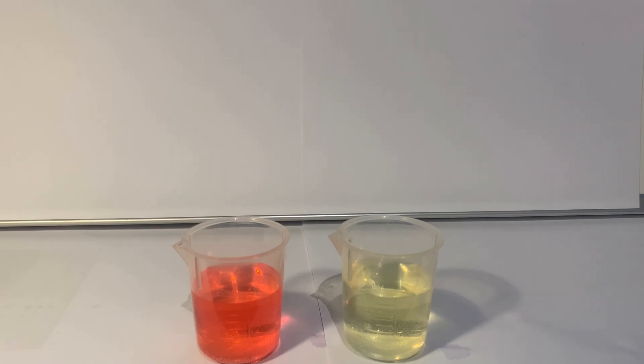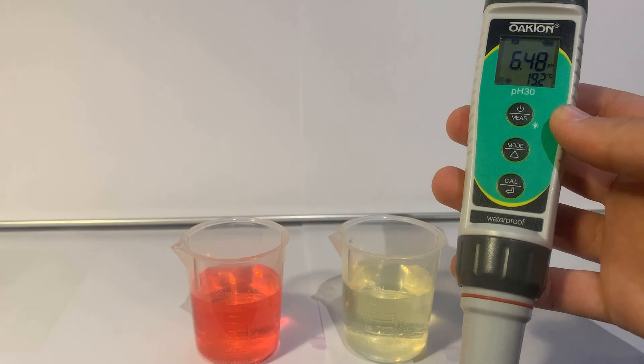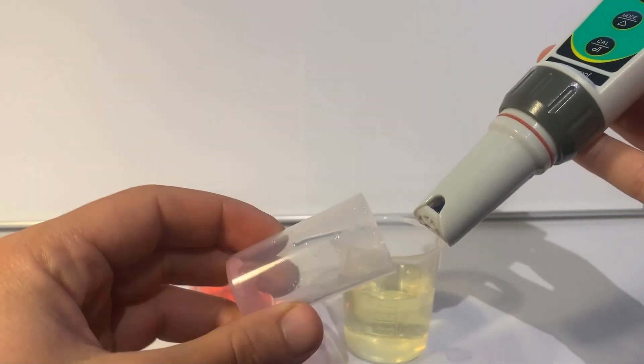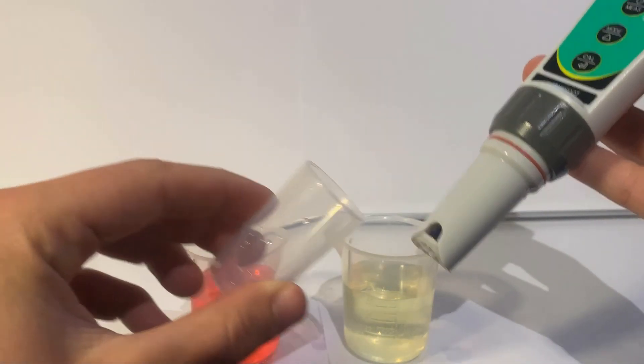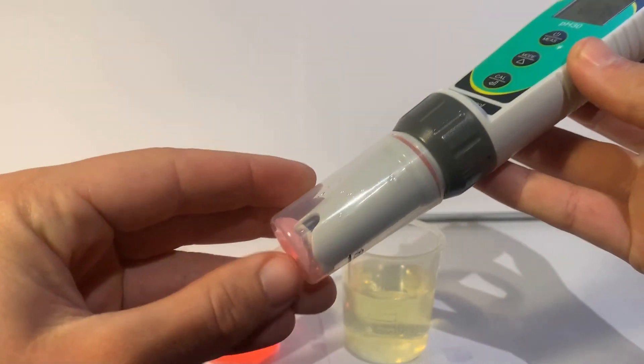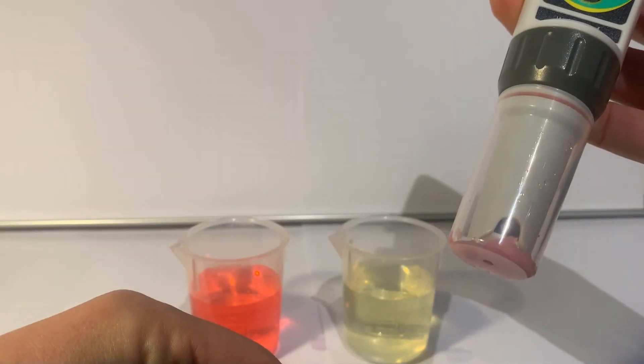Store your meter using either electrode storage solution if it's part of your monitoring kit, or pour a small amount of buffer 4 solution onto a small piece of paper towel to be stored at the bottom of your cap.